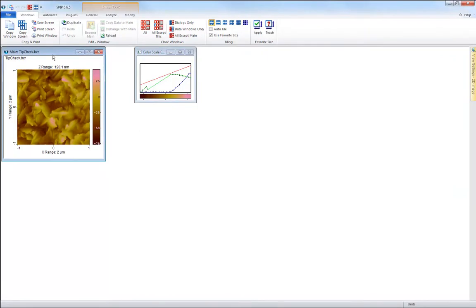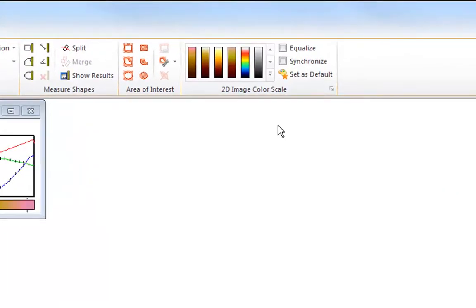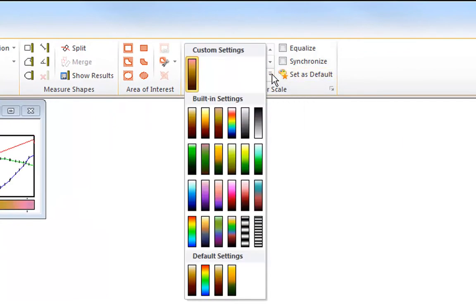And next time you look at the ribbon you will see that it has appeared in the gallery in the custom settings group.